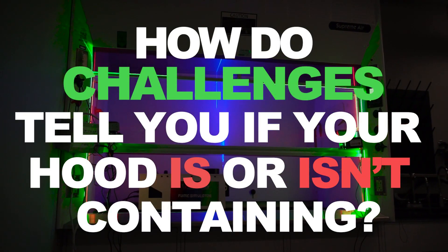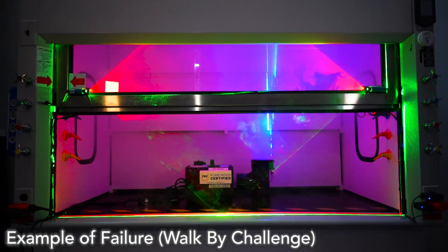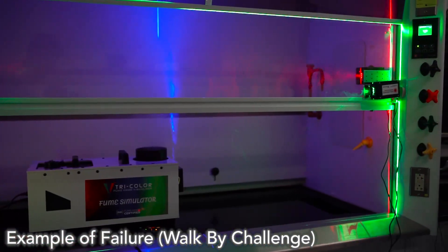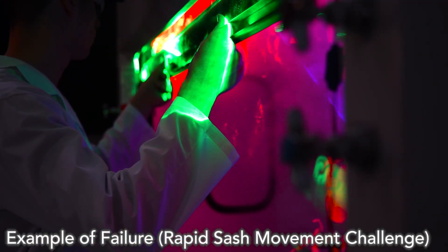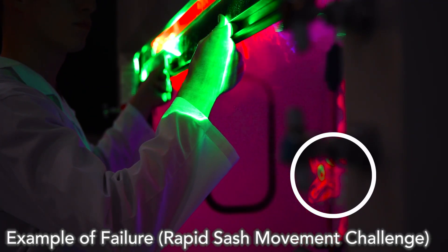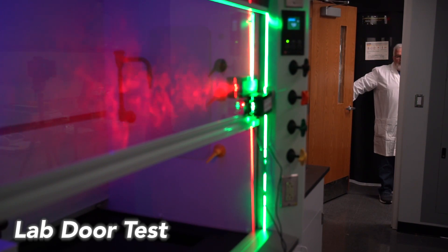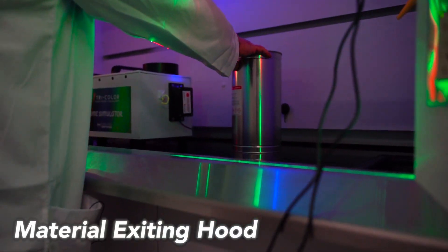How do challenges tell you if your hood is or isn't containing? Do you see green when somebody walks by the hood? Do you see green when you move the sash quickly? Do you see any green when the lab door opens and the room pressure changes? Do you see any green when you pull items out of the hood?